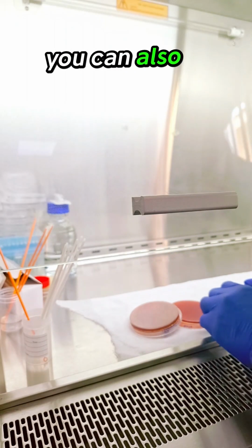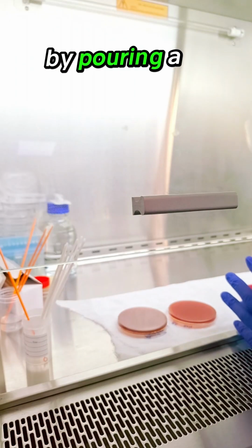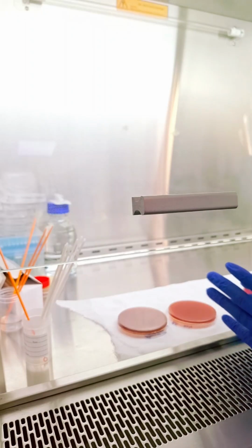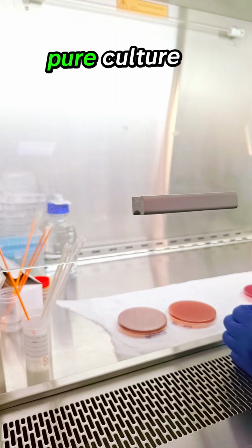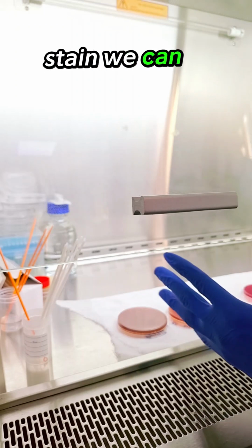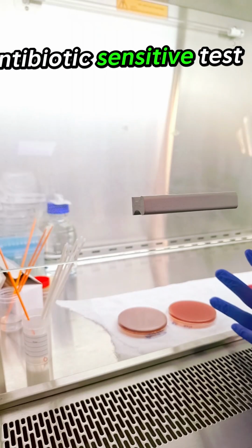And of course, you can also use the pour plate method. That's another fine method you can use, by pouring a mixed growth into a plate. By doing this, it helps us obtain a pure culture, so that we can do other tests like the gram stain, the biochemical tests, and also the antibiotic sensitivity test.